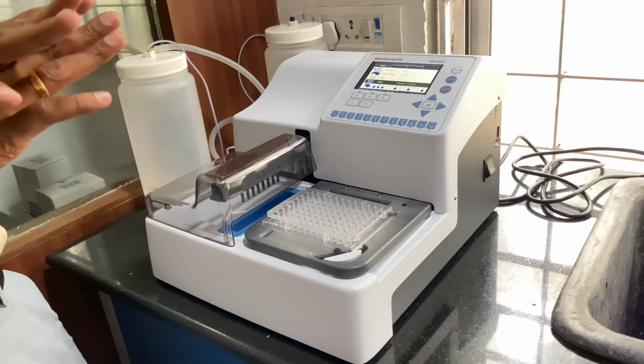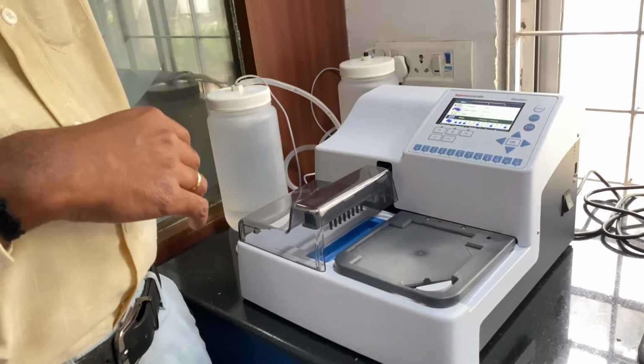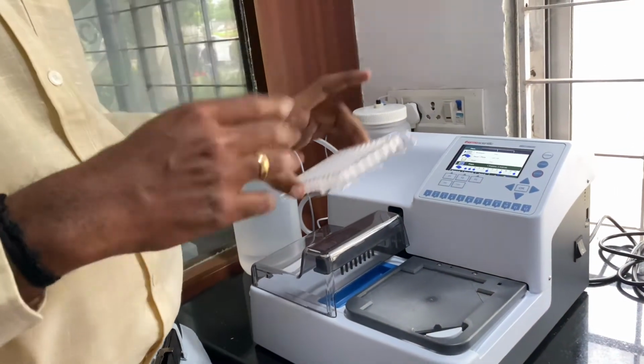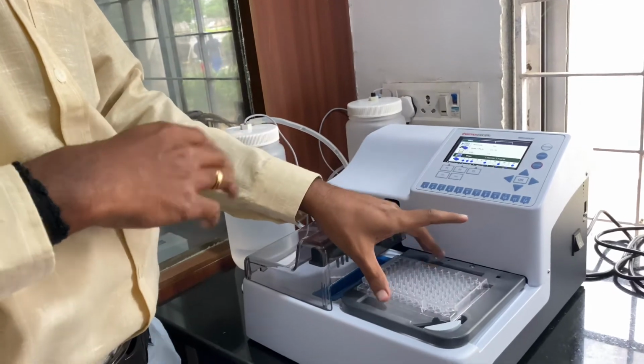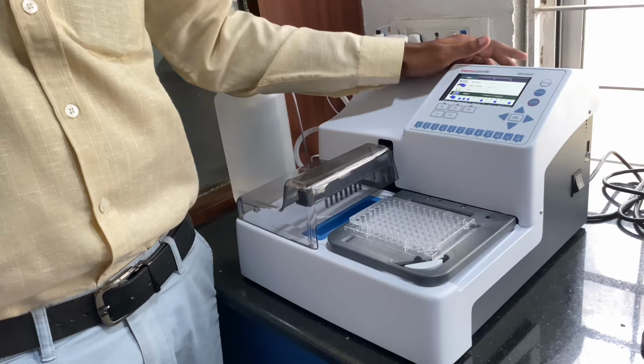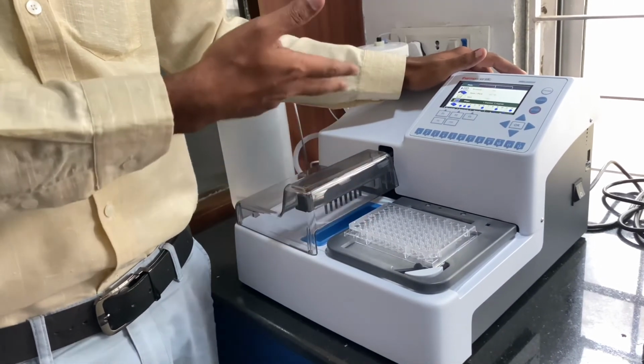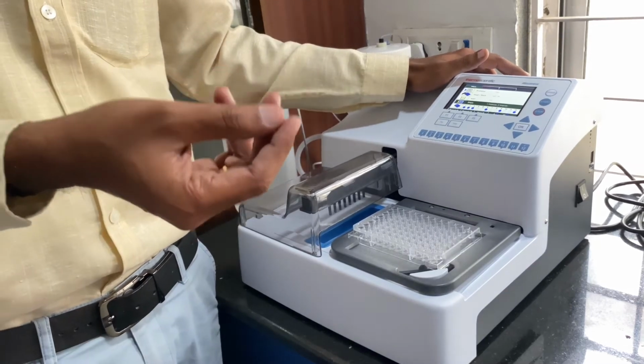Okay, once it is completed, you can check the plate. If there is anything in the wells, there is nothing. So like this, simple handling. For completion, how much time? For this, it depends on the number of steps. Now we have done a 96 well plate, 2 steps. It hardly took 2 to 3 minutes.